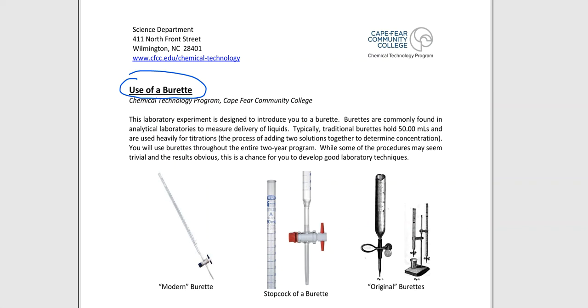And with this little short, oh, you know me, it's not going to be short, pre-lab lecture, we're going to talk about the burette, at least give you some idea of what you're going to be doing in the lab when you show up that day, and then we can pick up and run from that point on, and hopefully you won't be running out of the lab, because hopefully it's not that bad.